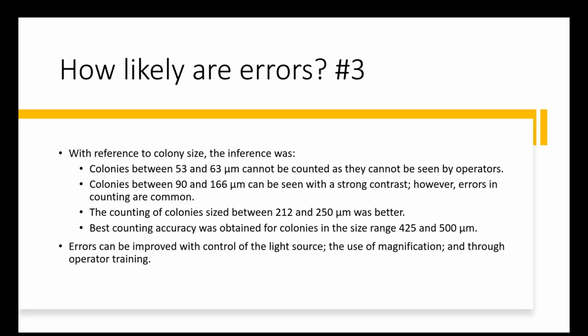So the final review placed the greatest level of error on simple limitations of the human eye, or the process of visual acuity. It wasn't because operators were being distracted or they'd read too many plates. It was simply that it is a challenging activity to do. And this led to a conclusion that such errors were more likely to be overcome with automated systems.